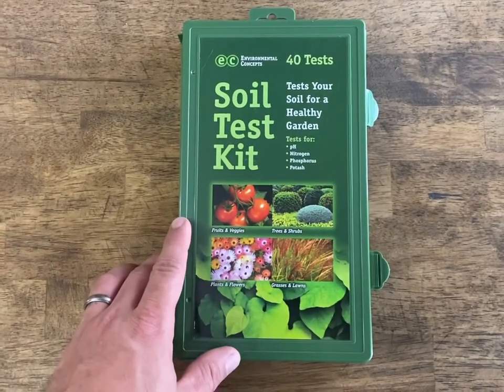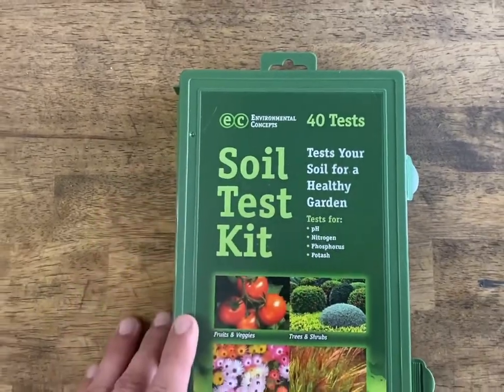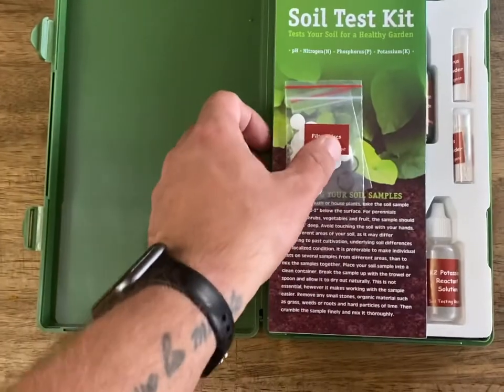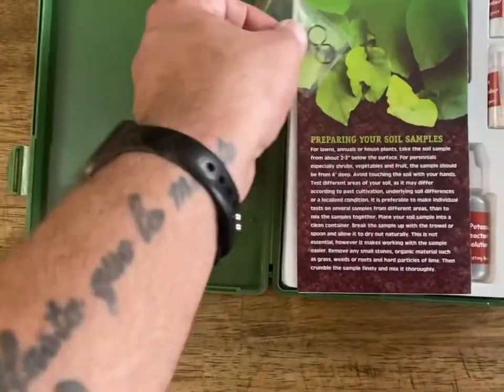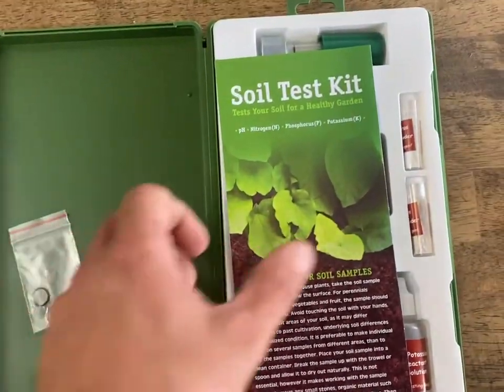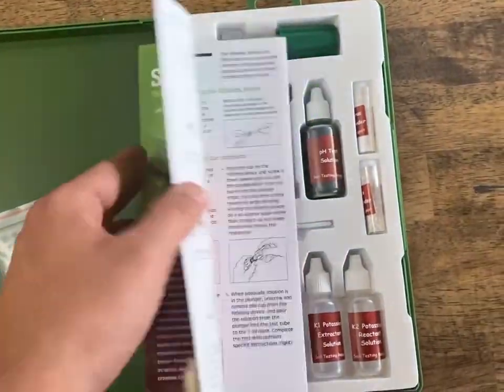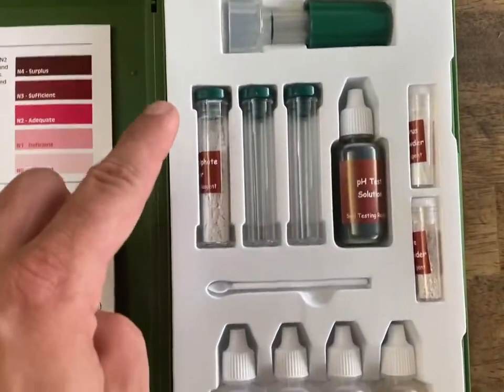What's going on guys, today we're going to test the soil with the Environmental Concepts Soil Test Kit from Menards. In the soil test kit we've got some filter discs, a couple of O-rings in case the O-ring goes bad on the tubes, a soil test kit, instructions, and of course all the gear.